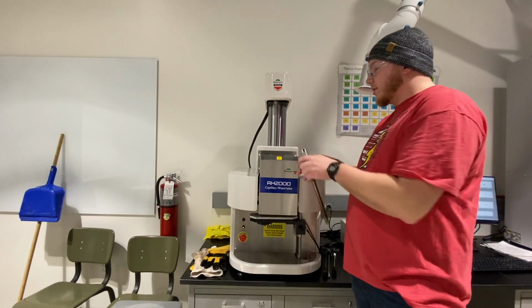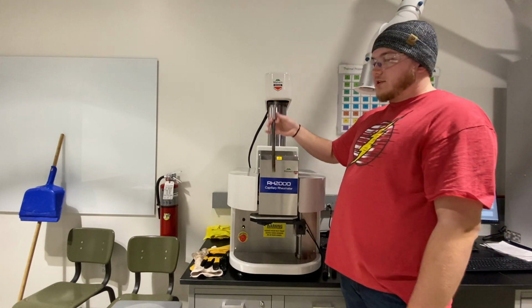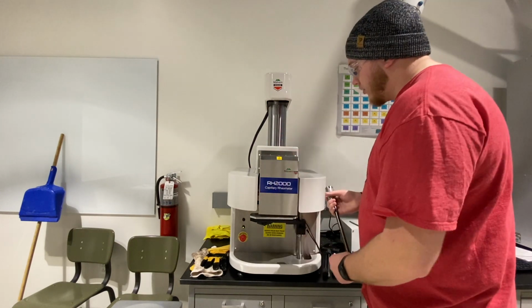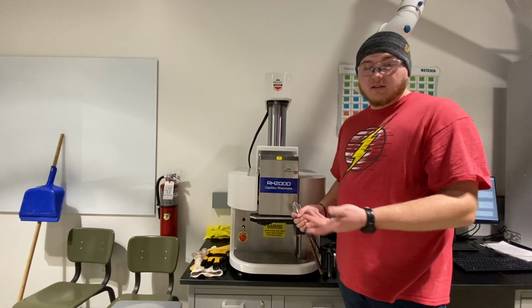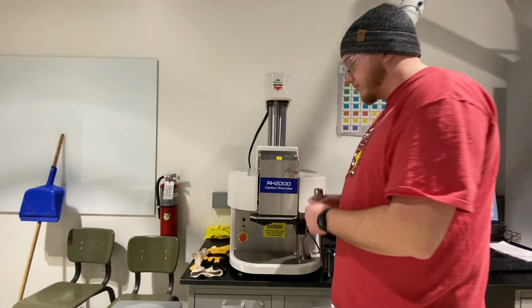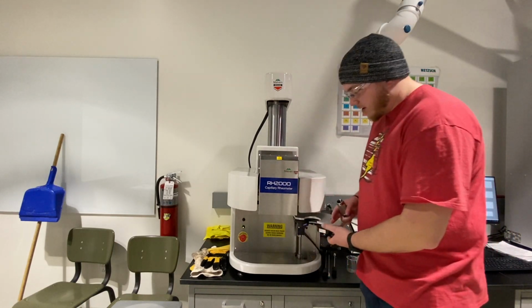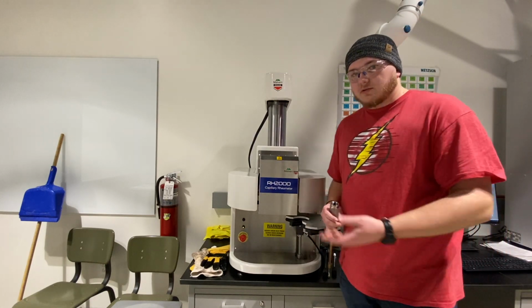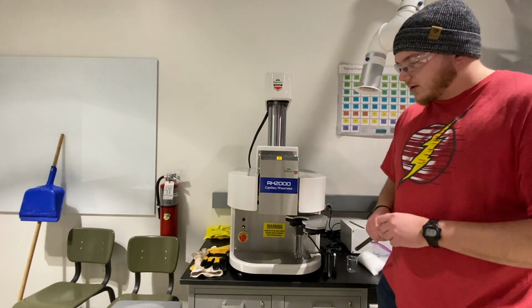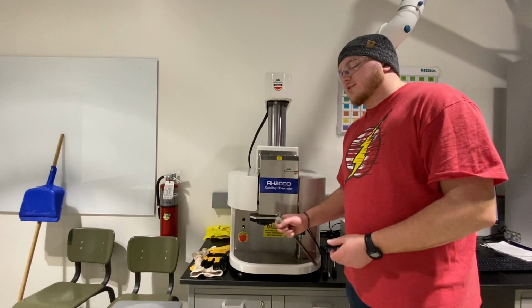It might be hydraulic actually, but what it'll do is drive the piston down into our left barrel here, which is already heated, and push the material out of the bottom through the die, very similar to the melt flow indexer. The die will be installed down here. This helps measure die swell as well as the rate at which it's flowing out of it. It's not super important, but if you're wondering what that is, that's why it's there.